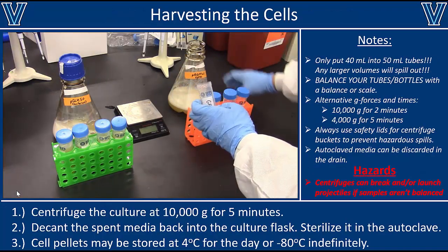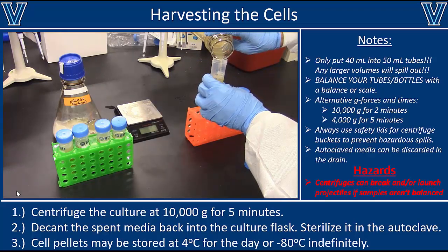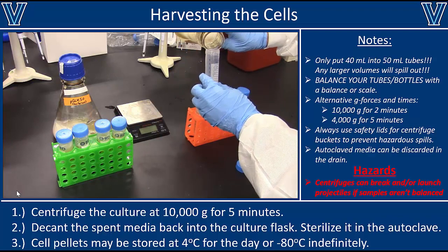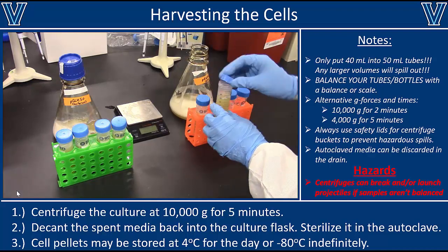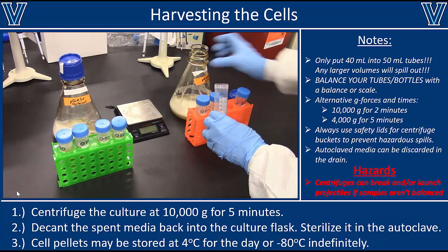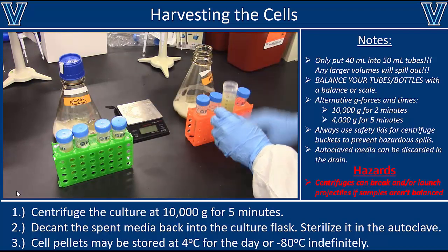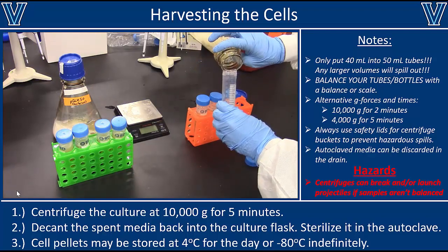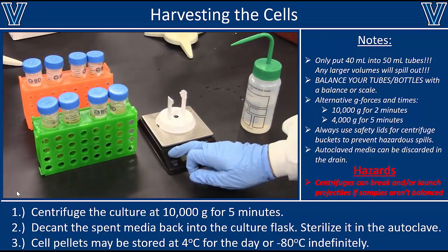The last thing to cover is harvesting the cells. If you have a large culture, dispense it into 50 ml tubes to centrifuge the cells. With a 250 ml culture split into tubes, only put 40 ml into each one — many tubes, even well-designed ones, will leak a little if filled completely and centrifuged at high speed, which is a bad situation with living cells contaminating your centrifuge. So I'm only putting 40 ml in each 50 ml tube; I'll need more tubes but I'll prevent leaks.